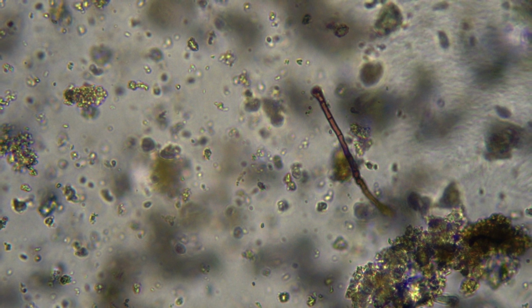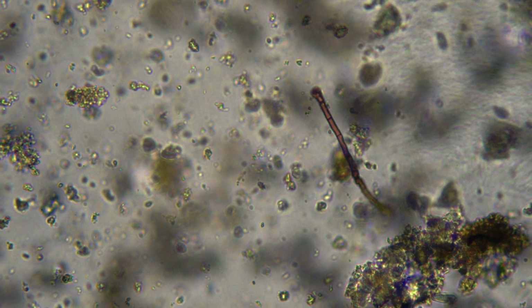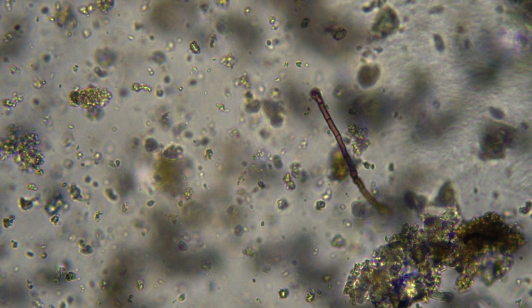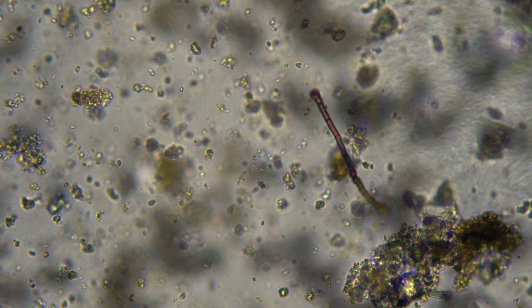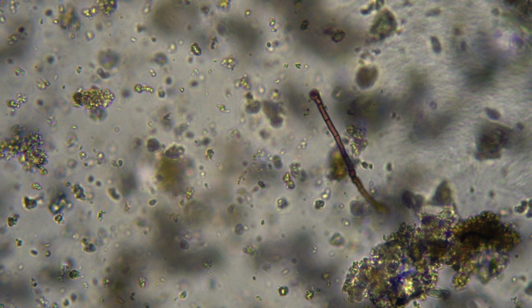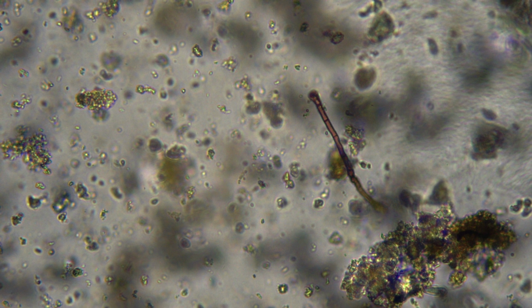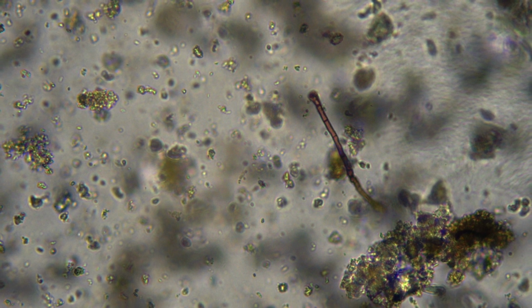But what I really love is you can actually see the cell division of this multicellular organism. And that's apparent by those dark blackish brown lines going across the straw-like structure. Which brings me on to photo number 2.